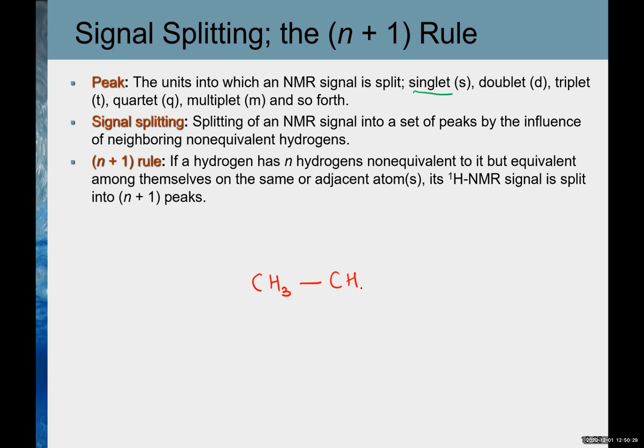Let's say I have this molecule. How many sets of equivalent hydrogens are present in this molecule? 2. So how many signals do I expect? 2 signals. So that is correct. One from this one, the other one from this one. Now we know the table. So can you give me some idea? If this is 0, where would signal A be and where would signal B be?